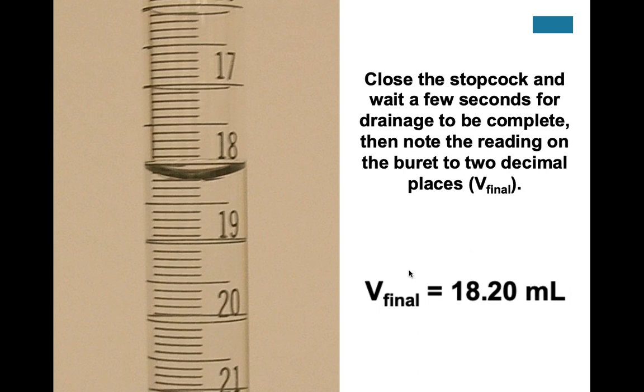And then we would go ahead and do our calculations of the neutralization reaction, and then we would solve for the concentration of the analyte. And then that's it. And that's how you do acid-base titration.